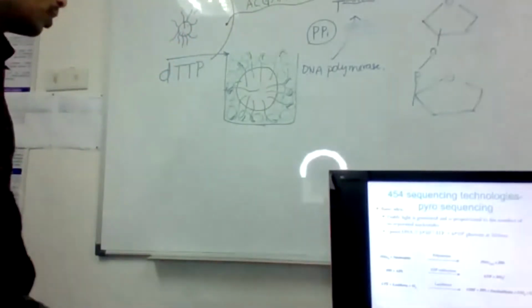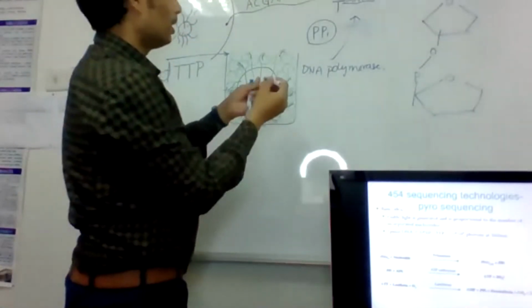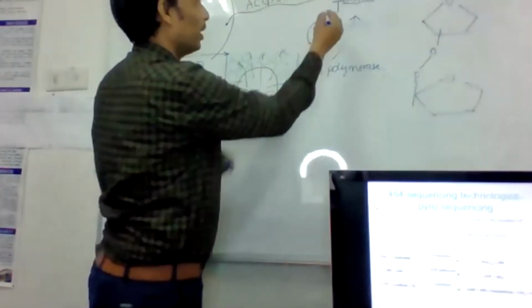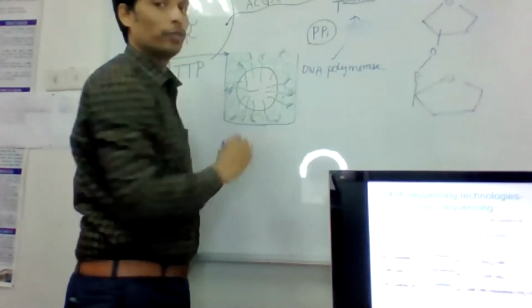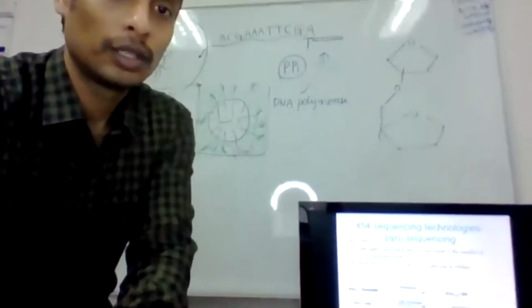Let us come to the well beads we are discussing. Whenever one T is added, in the first reaction pyrophosphate will be released.